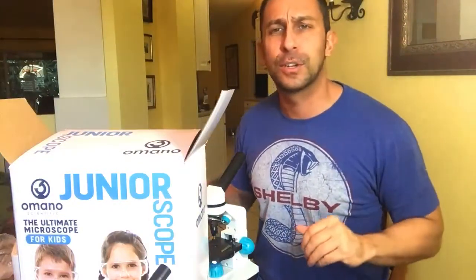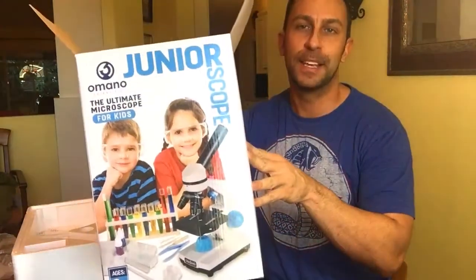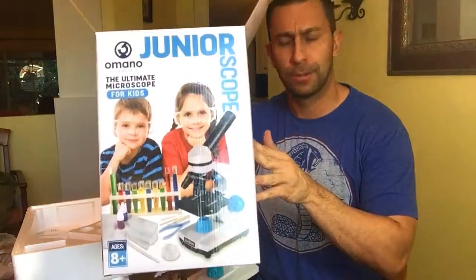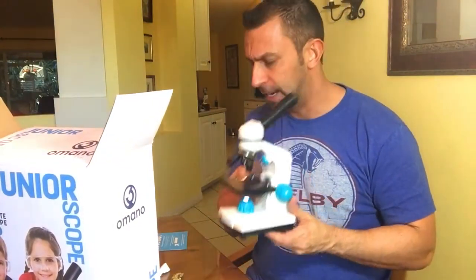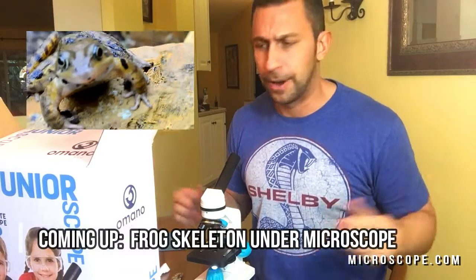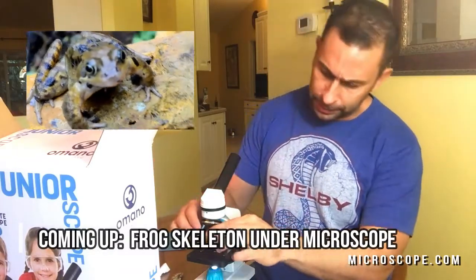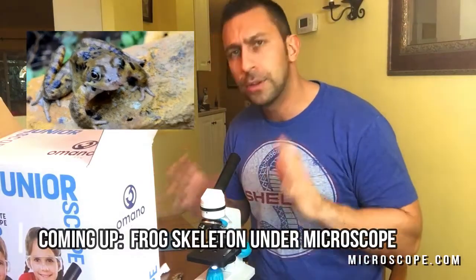All right folks, I'm Adam from World's Greatest Animals. Microscope.com was nice enough to send me this junior microscope — a fascinating little microscope which is going to be a great gift for your kids for Christmas or any other holidays. Christmas happens to be coming up when we're making this.